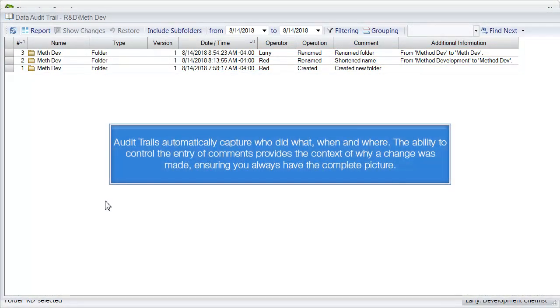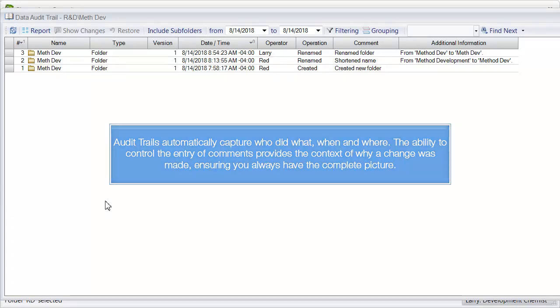Audit trails automatically capture who did what, when, and where. The ability to control the entry of comments provides the context of why a change was made, ensuring you always have the complete picture.